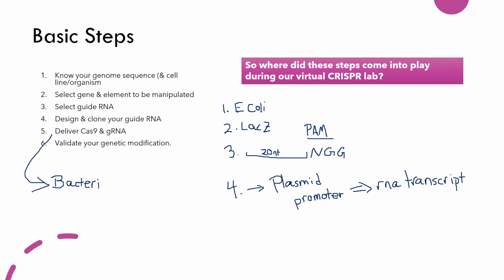Right, and that's the same thing you do to get any kind of DNA molecular material into bacteria, a transformation. Okay, so in this case, if we're just doing the cut, let's abbreviate that there. We put our pCas plasmid into bacteria here. And our target plasmid.